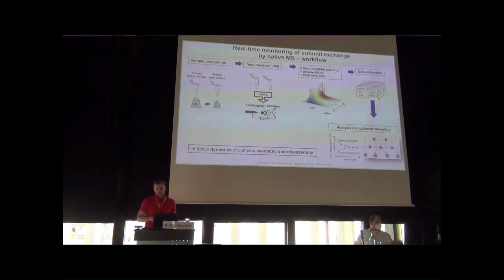The extracted data can then be analyzed using kinetic modeling, where you monitor the relative abundance of homo-oligomers and formed hetero-oligomers over time. By this, you get an idea about the dynamics of a complex regarding assembly and disassembly processes.